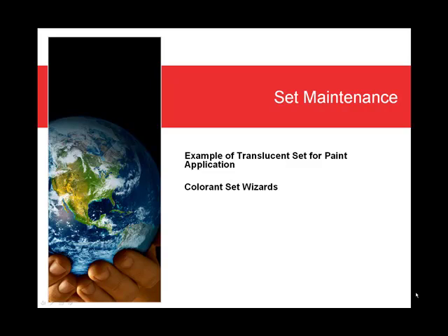Set maintenance provides wizards to help you to enter a new colorant set. When you start a new colorant set wizard, you will be asked to select a colorant set type: transparent, transmission, opaque or translucent.